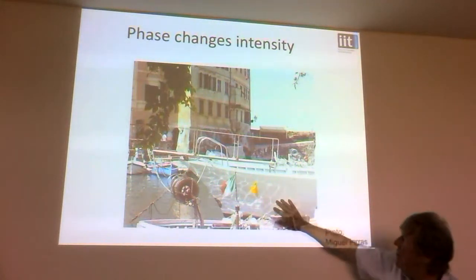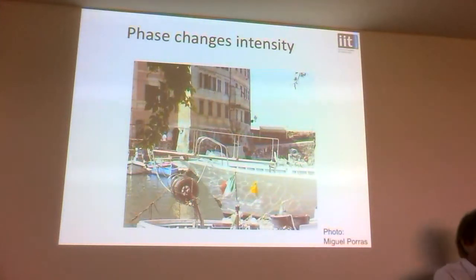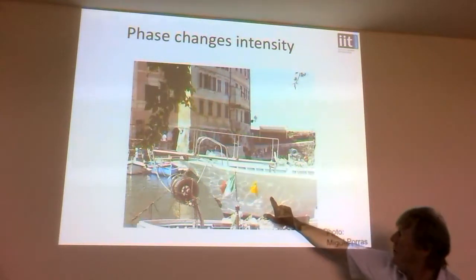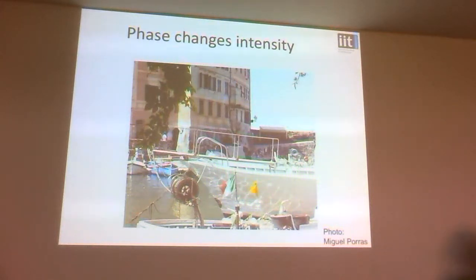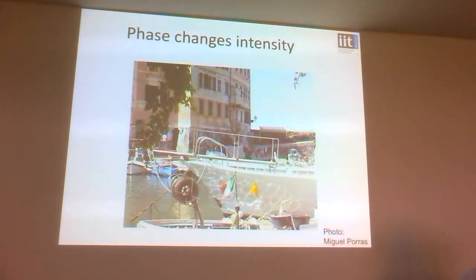So these lines you see, this line here is basically where the surface of the water is, like a cylindrical lens, which has got a line focus. And every now and then these join together to make a point focus, where that's much more unlikely to happen. Anyway, this is what we're effectively trying to do: look at this pattern and from that calculate what the surface of the water is.